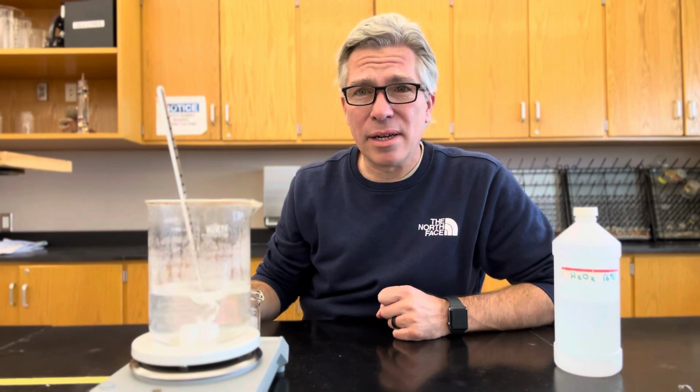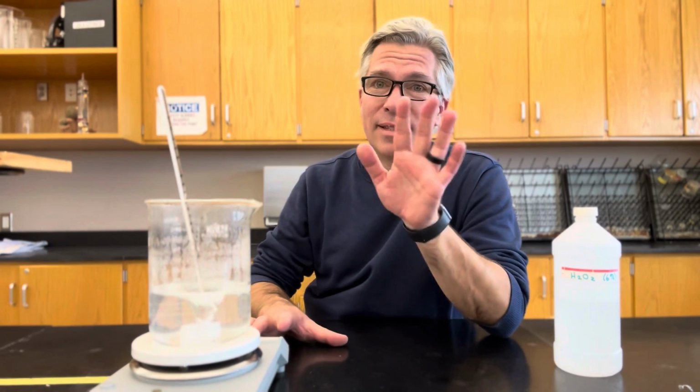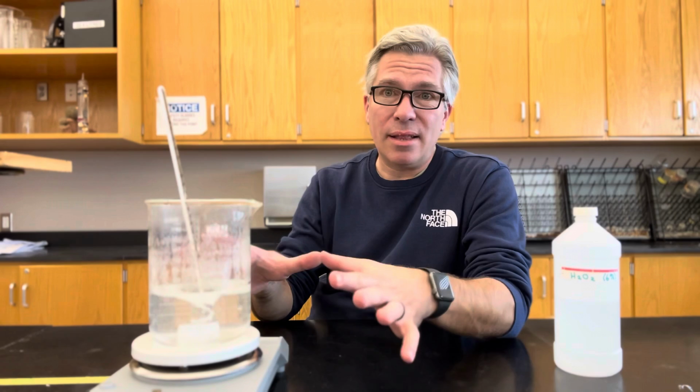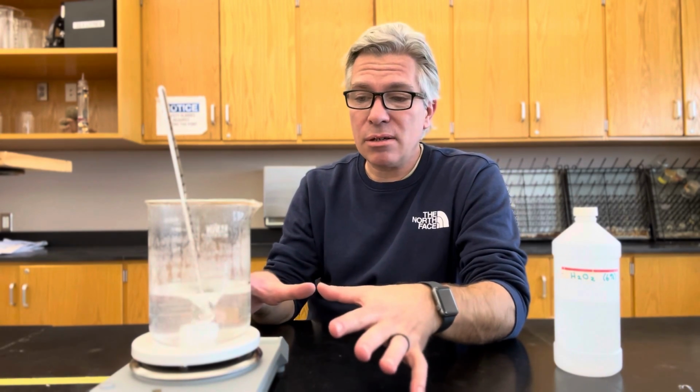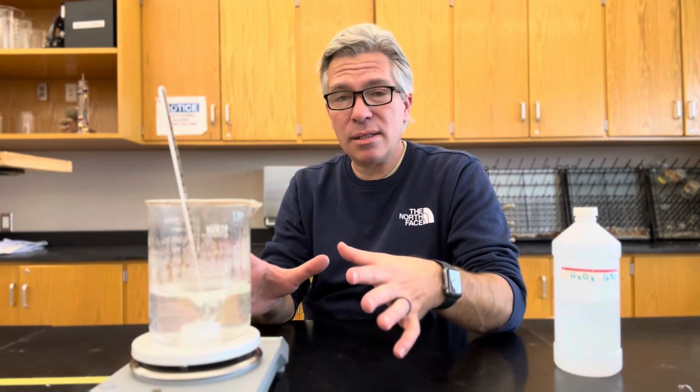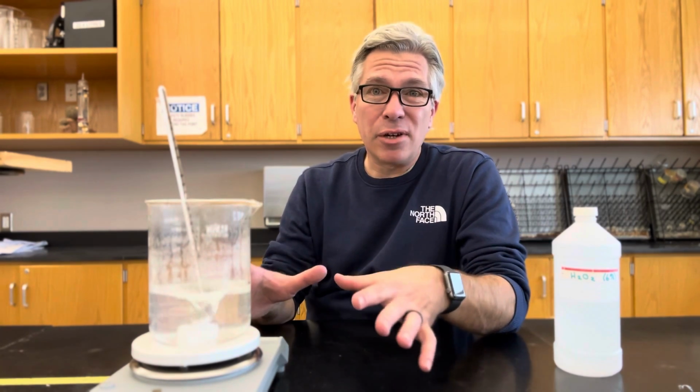Wow, that's exciting, right? So before you turn off your camera thinking this is the dumbest demo in history, just give me a moment. Believe it or not, there actually is a reaction happening here between the hydrogen peroxide and the tartrate ions, but the problem is it's very, very slow.